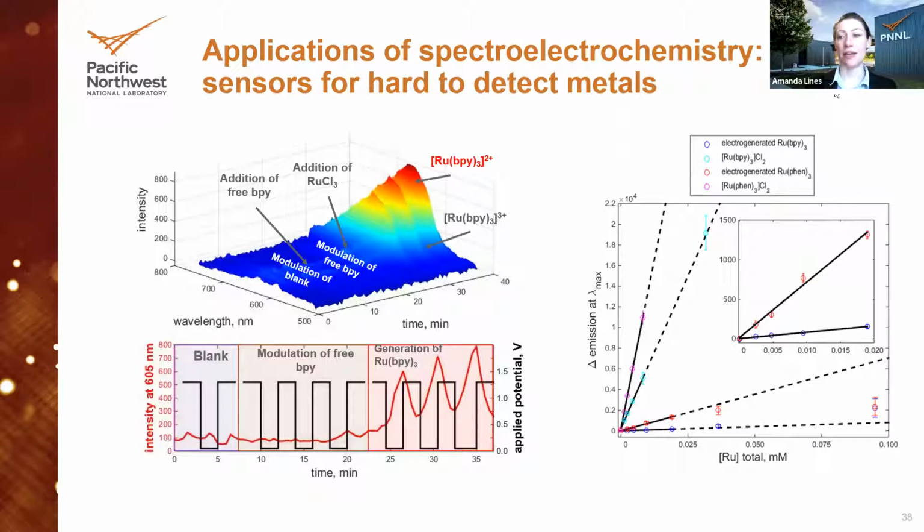We have run online monitoring demonstrations where we followed, let's say, Hanford tank waste. I don't know if you're familiar with that. That's a cleanup site. Hanford tank waste has just everything under the sun shoved in it. And so we've actually looked at Hanford waste tank samples where we are quantifying 9+ analytes simultaneously, even in the presence of even more interfering analytes that we're not necessarily interested in quantifying. They're just the junk that's in the way as opposed to the junk we need to care about. So yes, we are very much there in terms of processing power. Now it's a matter of building the probes, getting them into systems, and optimizing or designing the models to go after those different targets of interest.